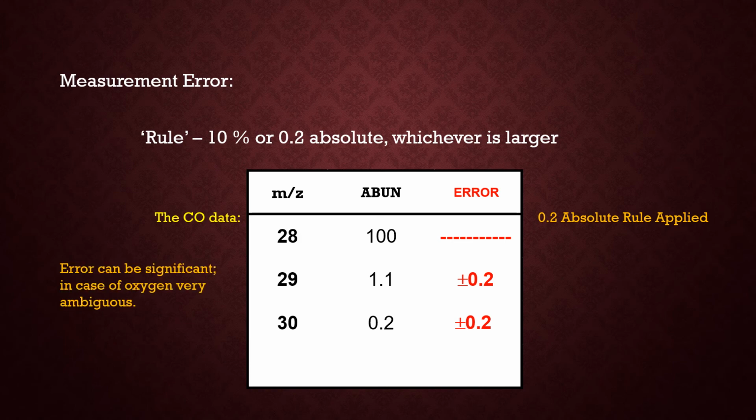The error in the case of the A+2 when oxygen is around is as big as the oxygen. So there's a good chance that in a given mass spectrum, I'm going to be a little bit off in my estimates on the oxygen. So I have to be careful, and we'll deal with the way to get around this problem in part 3 of this lecture. We're going to develop truth tables, in other words, to make things a little easier for ourselves.